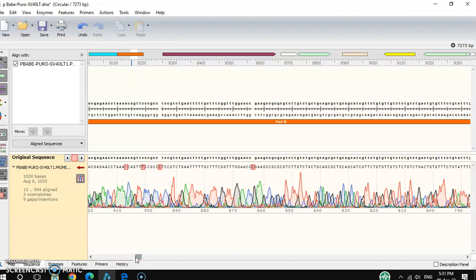Generally, you can rely on your sequencing result from around position 20 to 850 maximum. Before position 20 or after position 850, you cannot rely on the sequencing result.